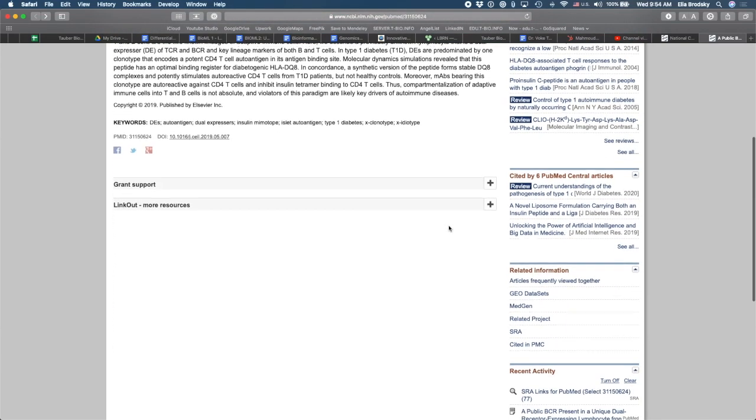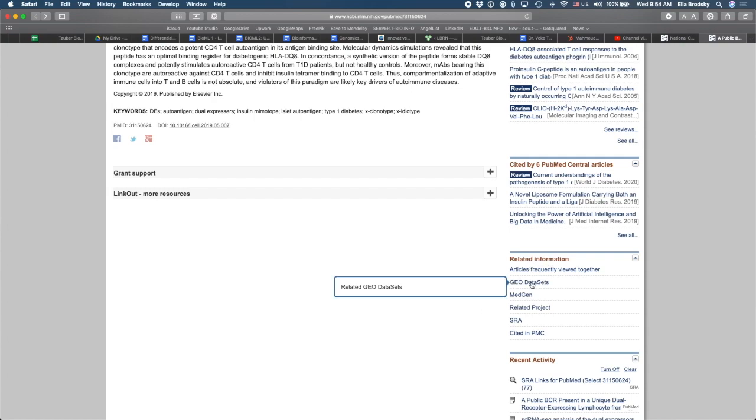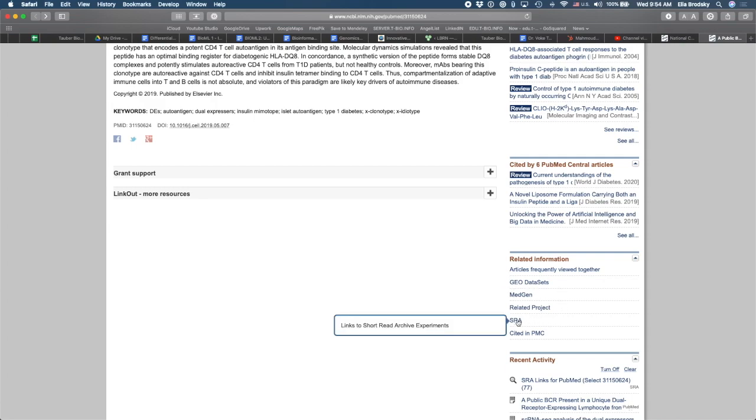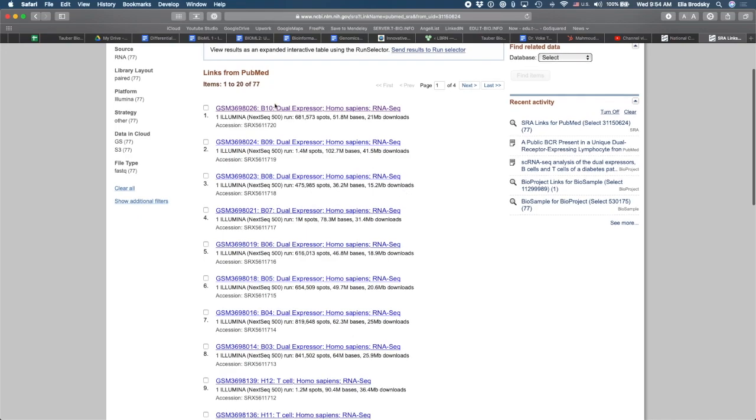What we need to do is we can go down here, and we can start seeing related information. And here we have the GEO data set. This will be the gene expression data from this data. And we can also find the sequence read archive. What's in the sequence read archive are the raw files, FASTQ files from this experiment. So you can see all of the different files. There's a total of 77 of them.